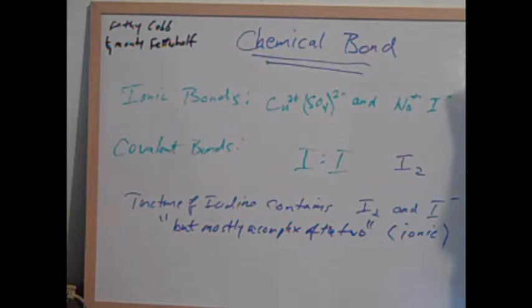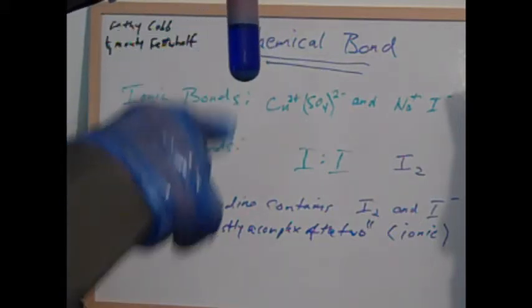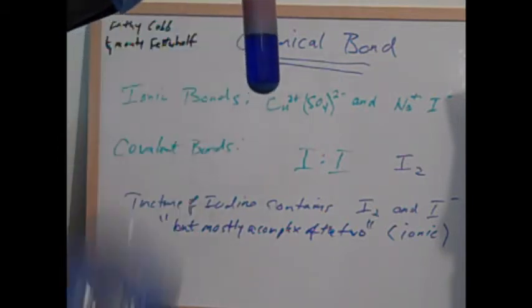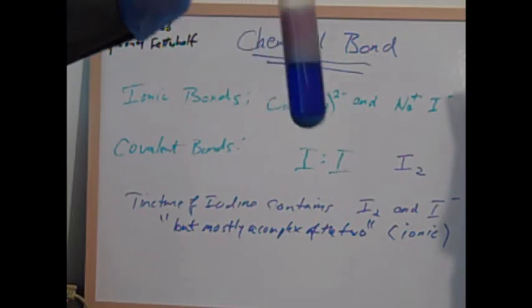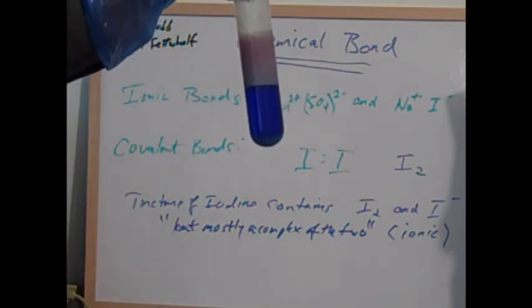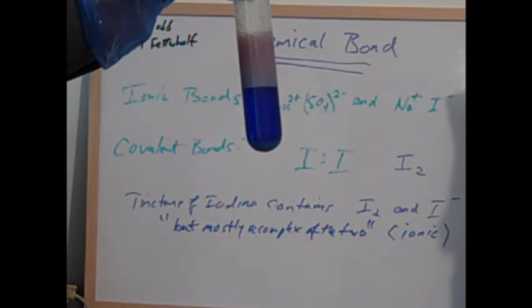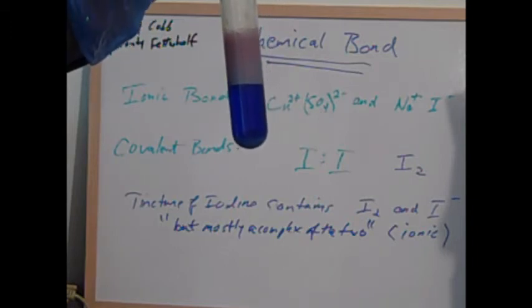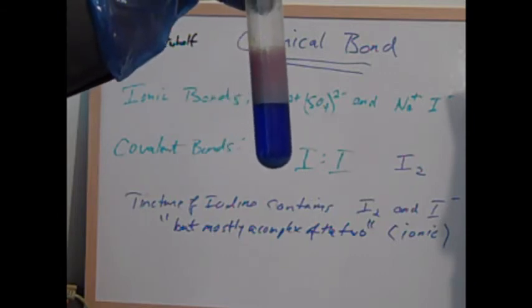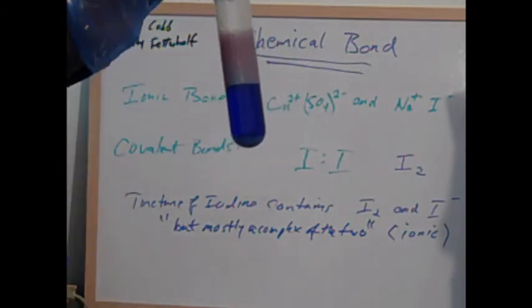But if you use a little bit less iodine than I did, this we did about an hour ago, you'll get a royal blue color in your copper sulfate, and some of your mineral oil will separate into clear mineral oil at the top. That's how they describe it in their book. The reason you get this royal blue color is a new substance is formed. You might have it later on in the book, but it's a copper ammonia complex. Okay? And that's the color of it.